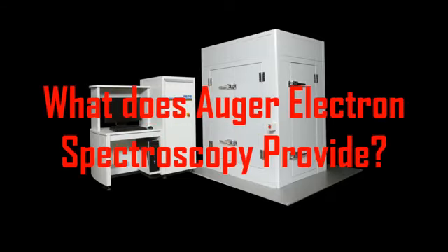Now, let's discuss what Auger electron spectroscopy provides to us. Why do we basically use Auger electron spectroscopy? Please note that, as I have previously discussed, this is a very diverse technique. This technique gives us information about the chemical composition and as well as about the presence of an element in a material.